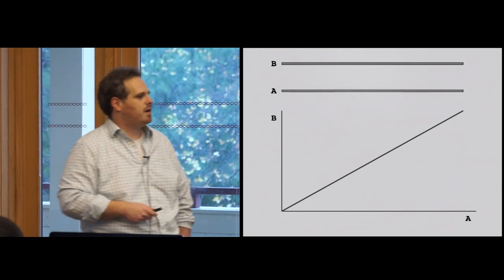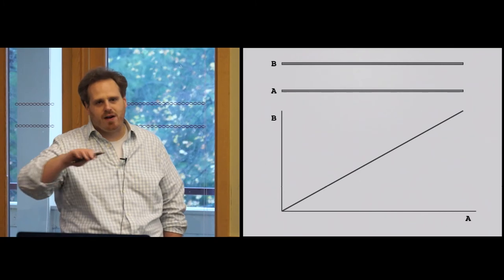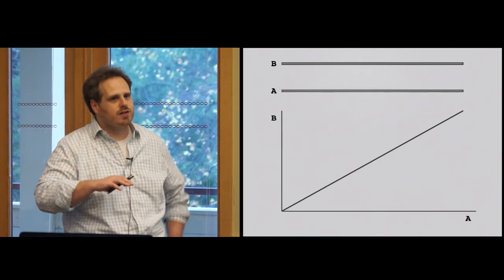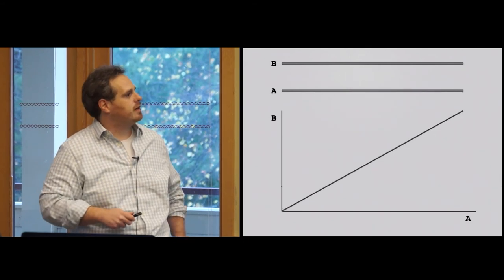We'll see another example of that in a real genome in a second. Critically, though, that sort of fuzz we can quickly filter out. We're just going to look for long segments of long diagonals or anti-diagonals, meaning inversions.